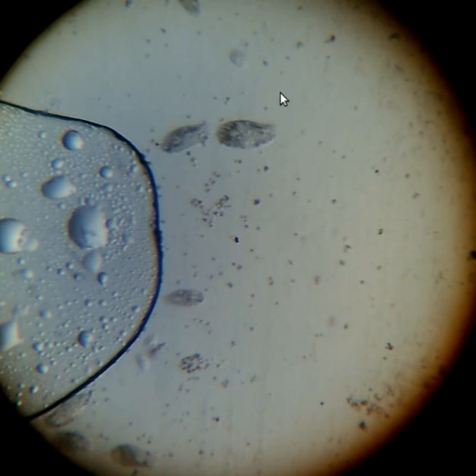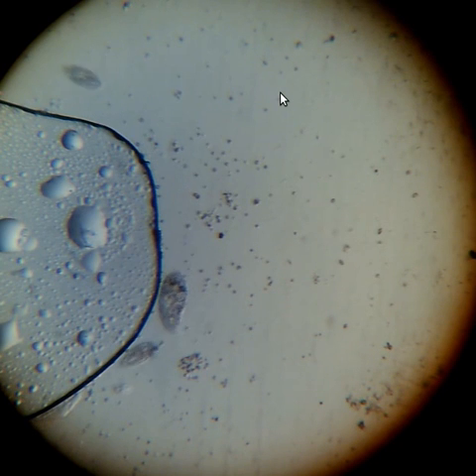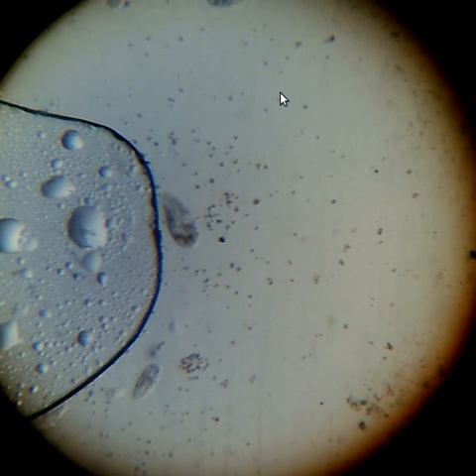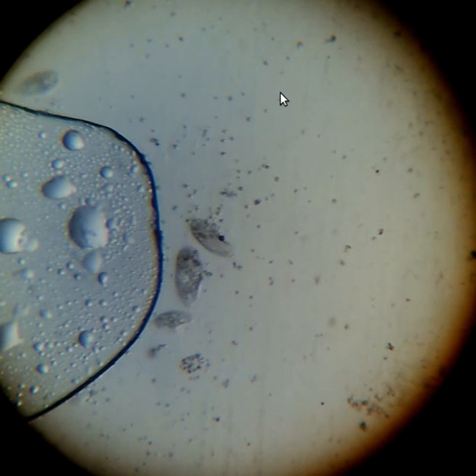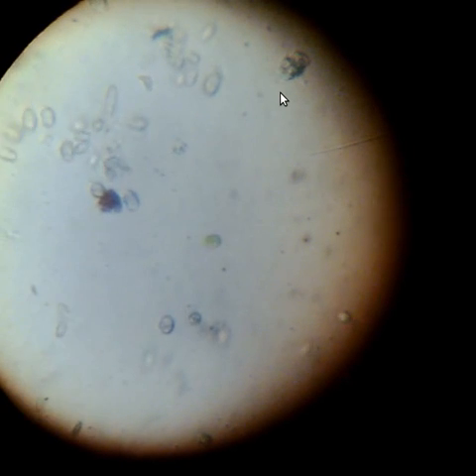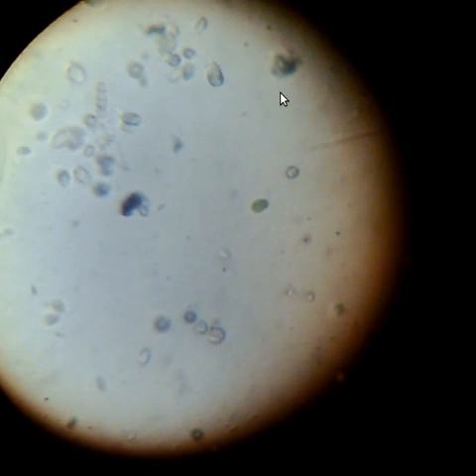I'm going to zoom in a bit more. The next level on this microscope is 400x magnification. Here we go — 400x. You can see there are little green things and bigger organisms coming and going. You can get an insight into what's inside them.